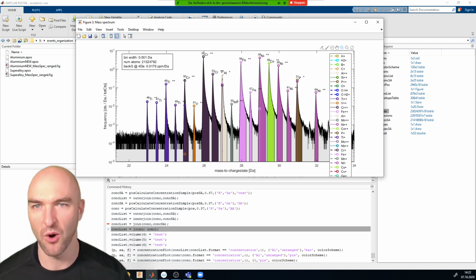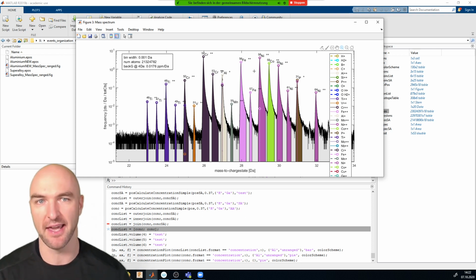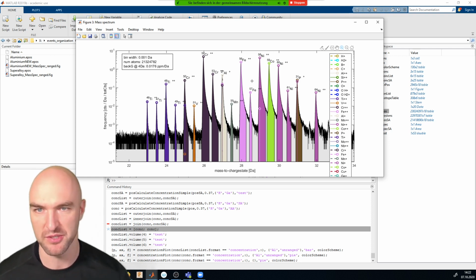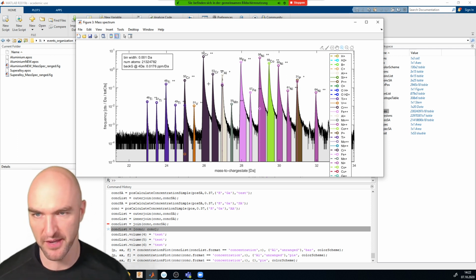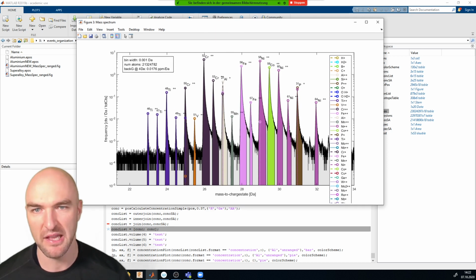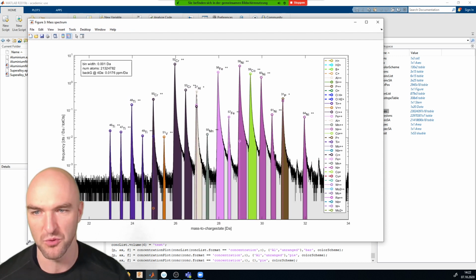So there's a whole number of peak overlaps there. We know, and can actually calculate from the isotopic ratios, how much that would be. But we have not used that very often in atom probe concentration determinations. Usually if people have done that, they were singular efforts, and haven't really made it into widespread use.